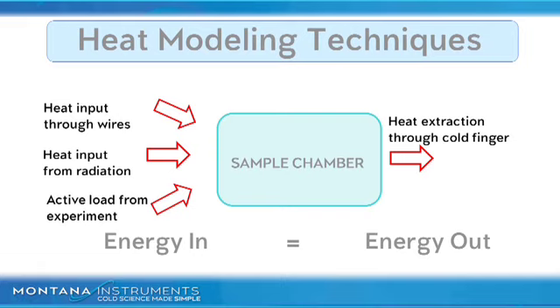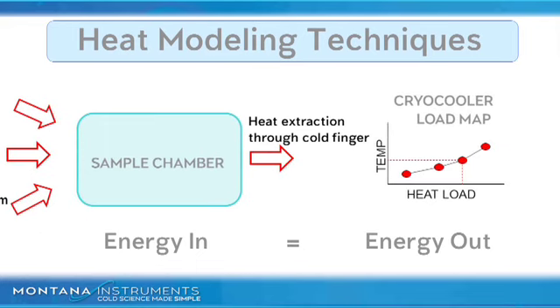Rather than model each path imperfectly, we model the system response to power input. This gives us the thermal absorption rate of the system, measured in degrees per watt. You can also think of this as the slope of the system power curve. This is dependent on the entire system status, including the temperature, windows, wiring, and other things. Once we know this, we can try improving sections of that system and see how much they contribute to the losses. Here is a power curve which represents the system base temperature for a certain amount of input power.